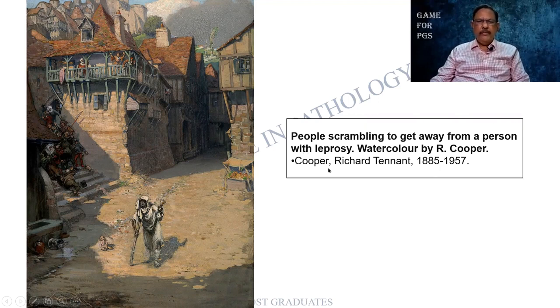And this particular person happens to be one of the pioneers in designing a stain for deparaffinized sections. So this is of paramount importance, and I was having a lot of difficulty in picking up pictures of the great stalwarts who had contributed towards Hansen's disease.